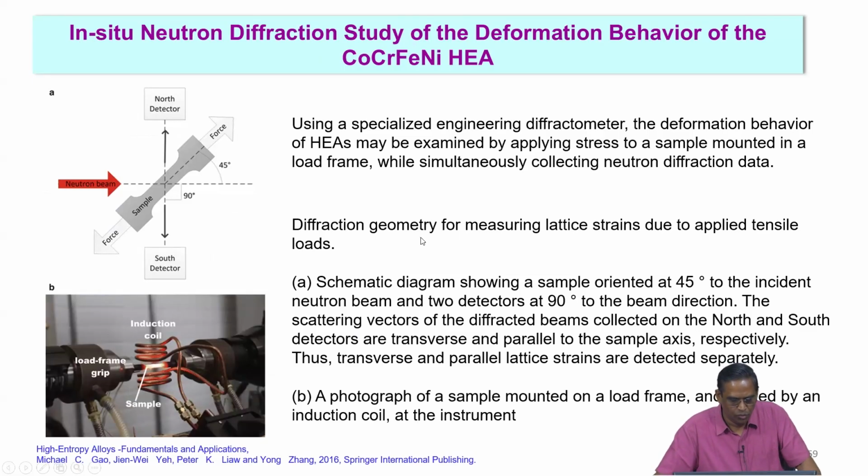So, why do we do an in situ deformation study? That is the first thing. We say in situ neutron diffraction study. Most of these sophisticated analytical techniques or tools are available in national centers. It is not easy to set them up in every university or research lab.